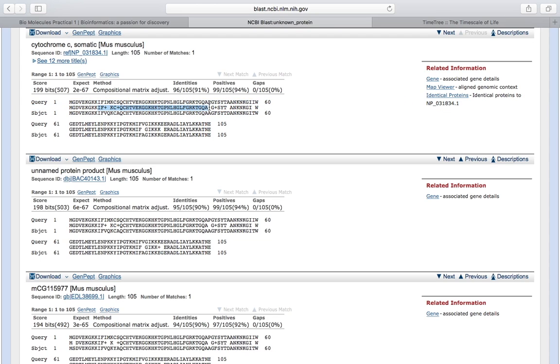As you can see, we're starting to have the gaps here. Now, gaps doesn't mean gaps like here. We might come across gaps later on. But what this means is that instead of a P, we've got an A. So here it's all identical.